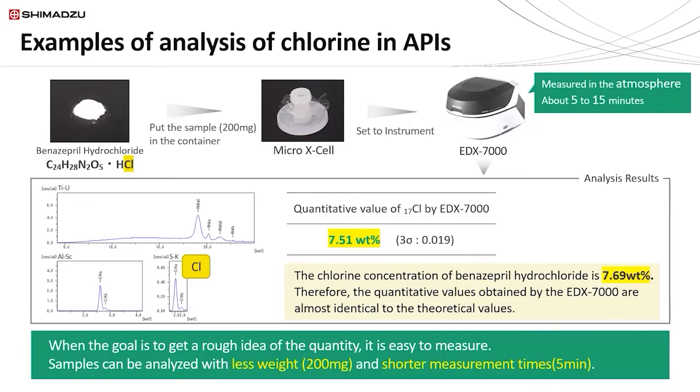Now, you might be thinking, how is this even possible without the use of external standards? And what's nice about the X-ray community in general is that they enjoy theoretically interpreting XRF and actually all sorts of X-ray data: X-ray absorption, X-ray photoelectron spectroscopy, X-ray fluorescence, SAXS and WAXS data, and so forth. And there's actually a theory out there for quantifying elements within matrices without the use of external standards.